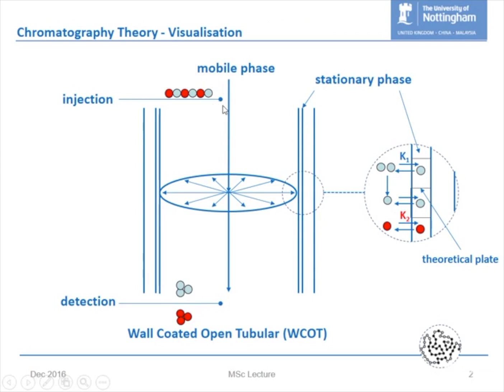So just going back to this representation here, very simple thing with chromatography. We want to take a mixture in a concentrated form and move it down the column. We're trying to strike a balance between the rate at which it's moving this way and the amount of radial diffusion and interaction with the stationary phase. But at some point it will come out the end of your column, and we will have a situation represented by this little schematic here where we've got two separate species that have been fractionated, separated, and then they can go through the process of detection.